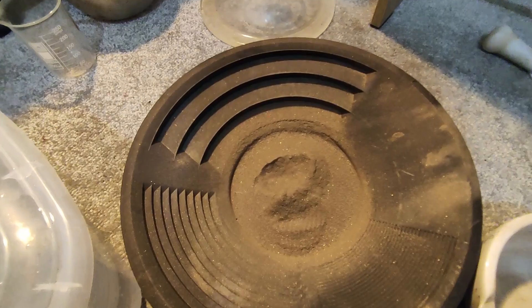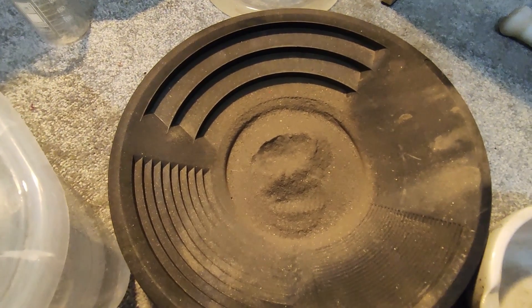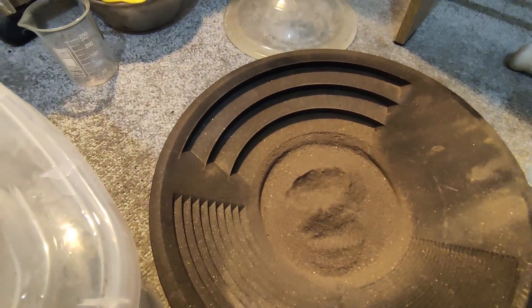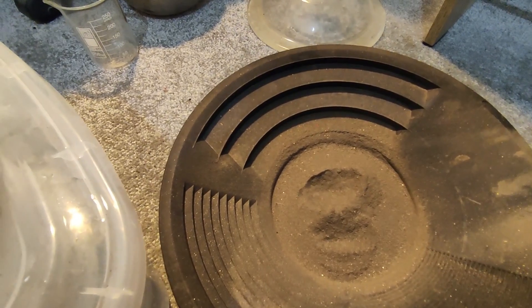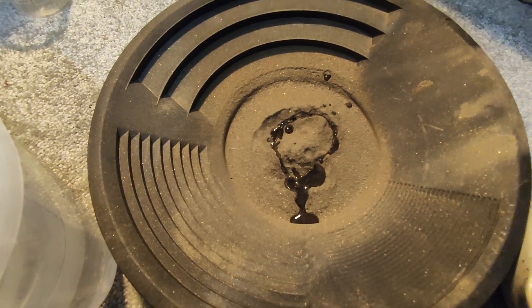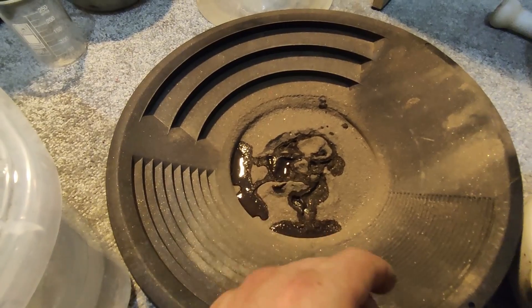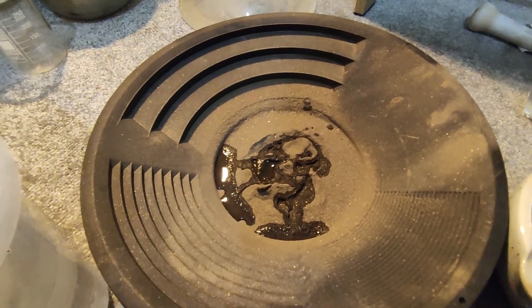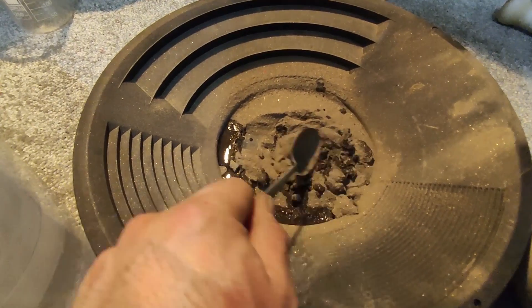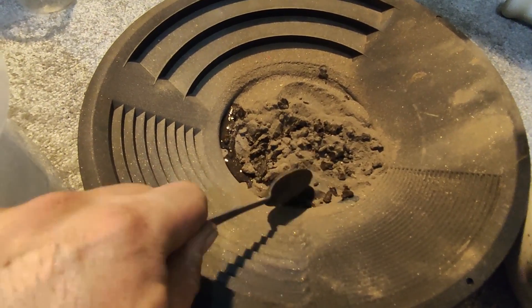To reduce water surface tension, I'm going to add some surfactant — I have a silicone-based surfactant. This surfactant will help sink the gold powder to the bottom more easily. After mixing, I'm going to add this to the concentrator machine.